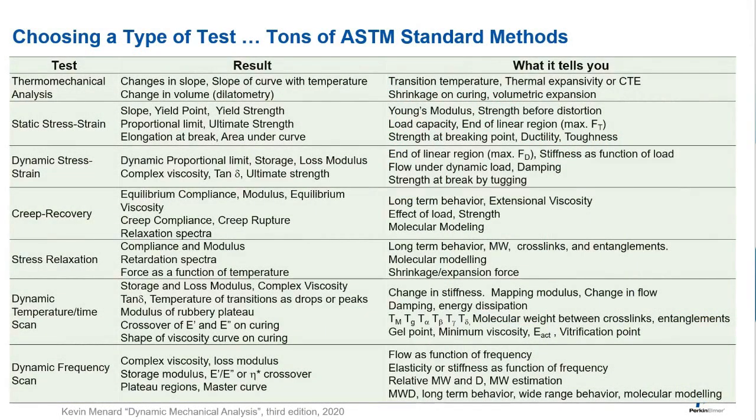After all this information and application we just covered, what type of test do I choose, you may wonder. There are tons of standard methods, including the ASTM methods, you can choose from. The test needs to reflect the type of stress the material will see, the frequency at which this is applied, the level of stress and strain, and the sample environment. Here are some most used tests listed in the table.